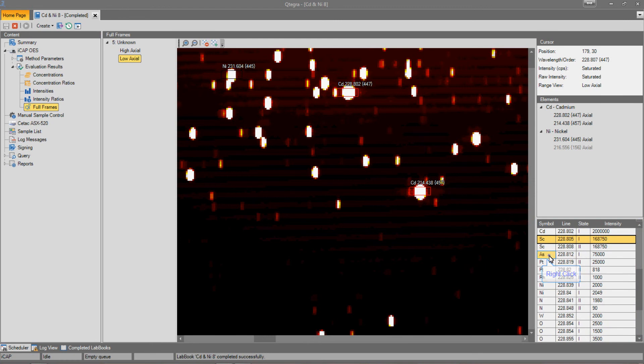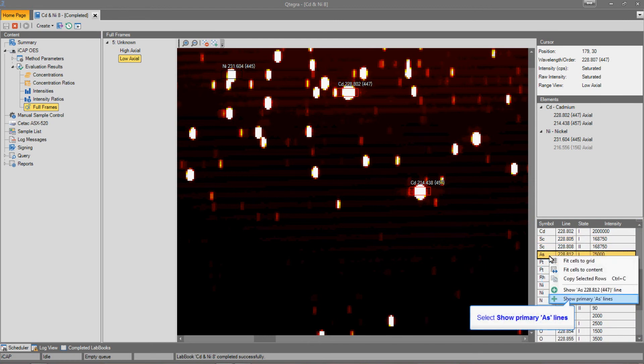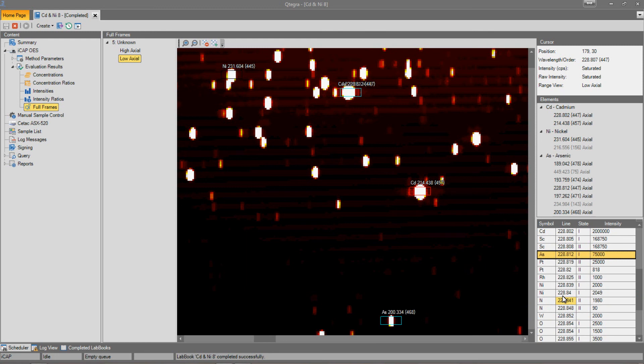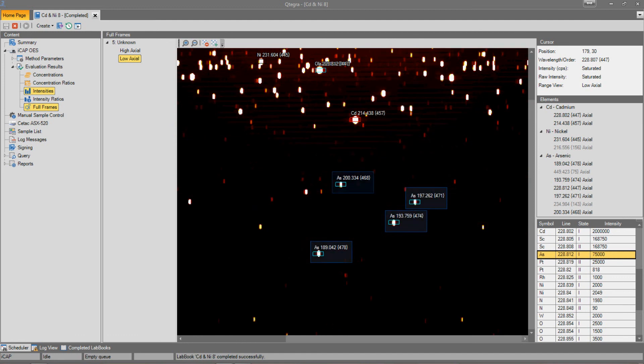I suspect here that the interference is arsenic, so let's right-click on the arsenic. And then if we select Show Primary Arsenic Lines, the primary arsenic lines are added into the full-frame image.